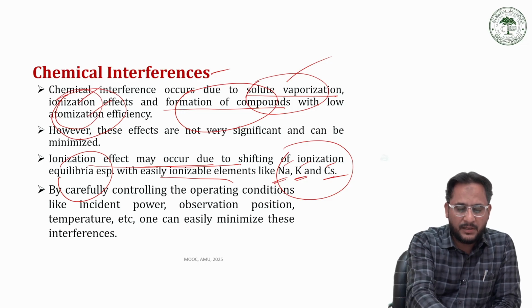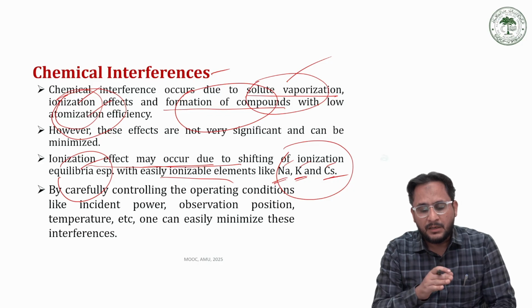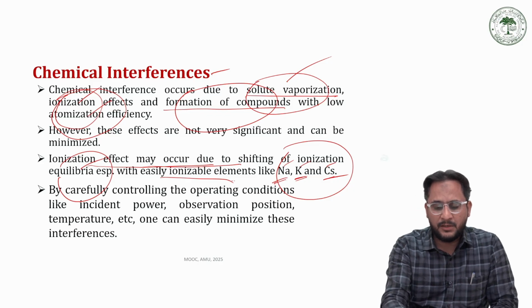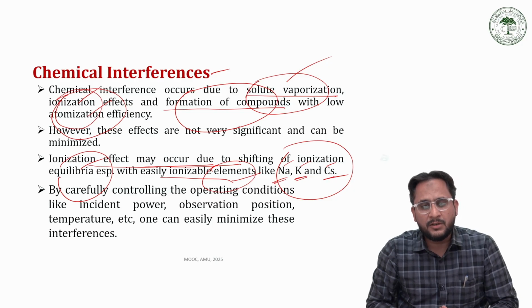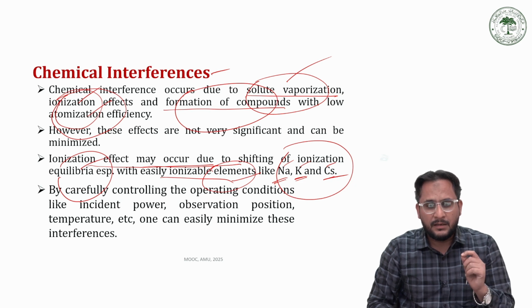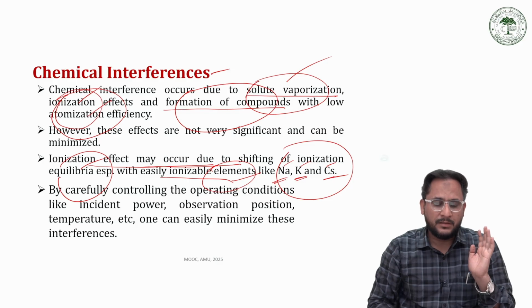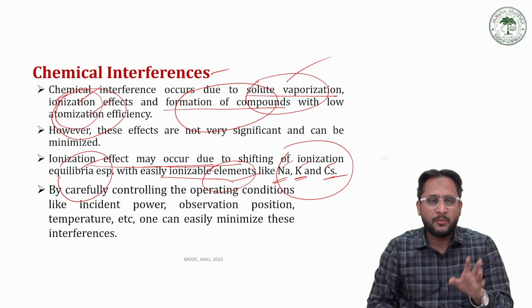This is a type of ionization effect. It ultimately causes the possibility of missing that particular element, or its concentration is not determined properly.